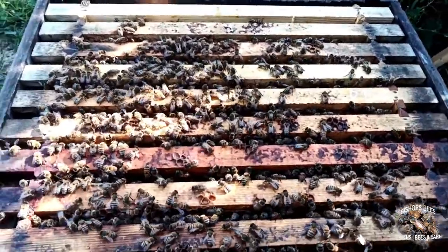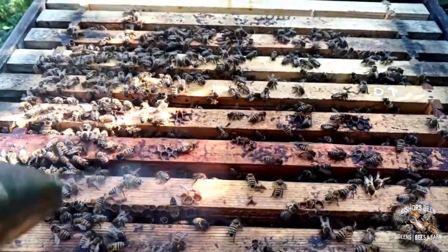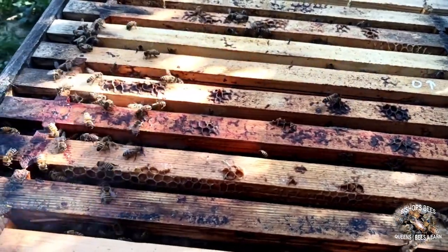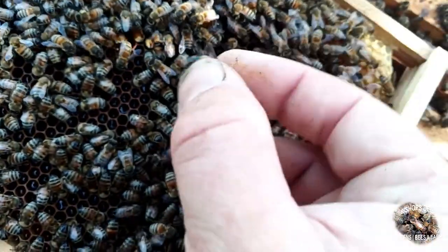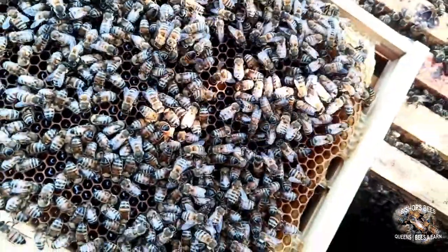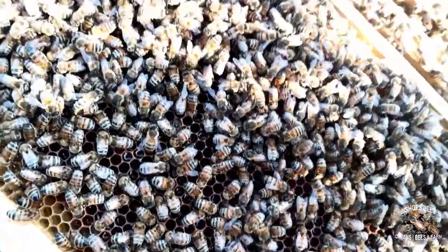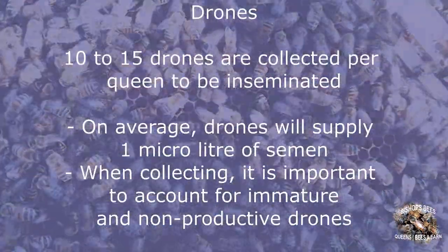We first start by collecting drones from drone colonies. These are colonies which have met our selection criteria and have been provided with additional drone cones for the queen to lay in. The drones are held in the colony by putting a queen excluder across the entrance to prevent them leaving or any other drones from coming in. They are held for 16 days post emergence to make sure they are nice and mature before being collected. They are collected from the outer frames of the colony where the most mature drones are found. We collect 10 to 15 drones per queen to be inseminated, and each drone will give us approximately 1 microlitre of semen.